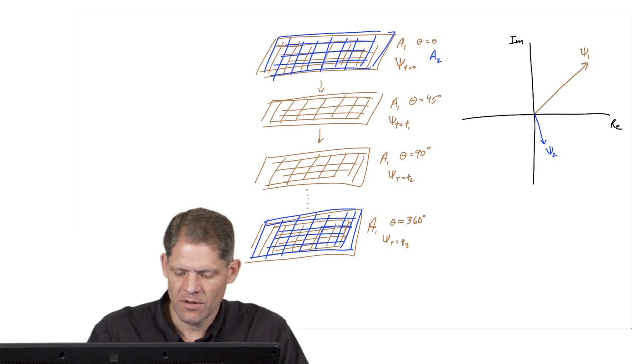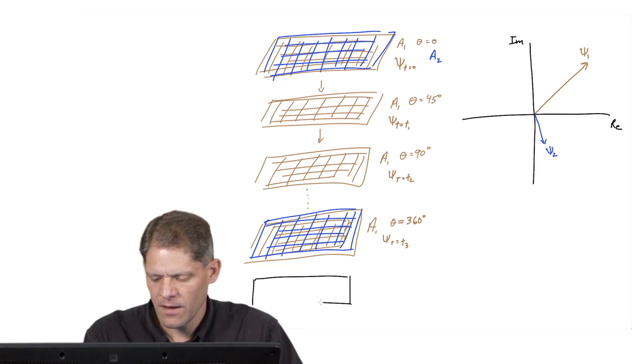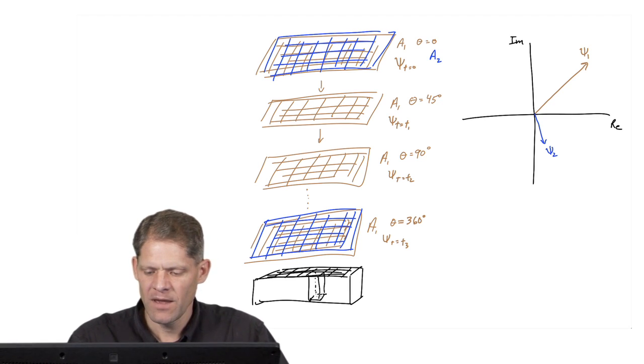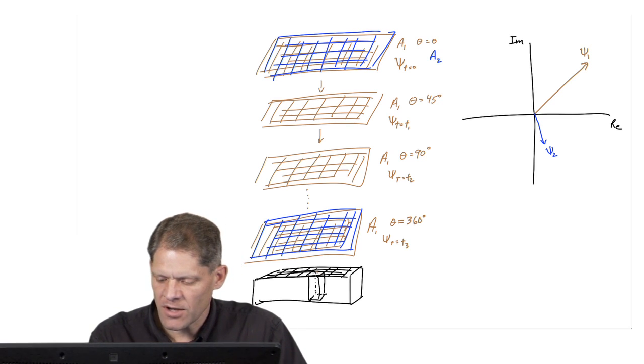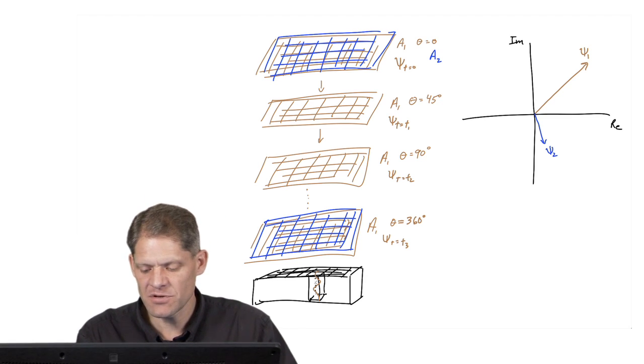Now let's suppose that we had a detector here. And in this detector, the detector had a number of pixels. And so each pixel here has some depth to it. I'll try to draw a single pixel within the detector. And the point is that we're going to have one of the waves traveling through that pixel of the detector with a particular amplitude and phase.